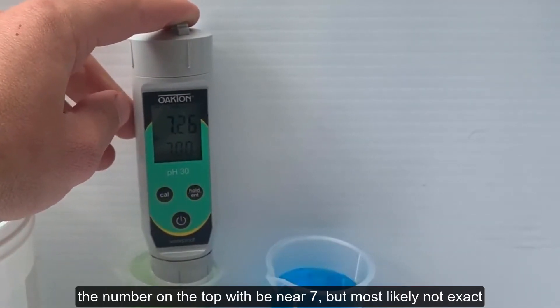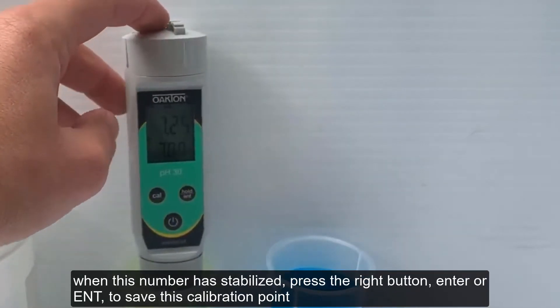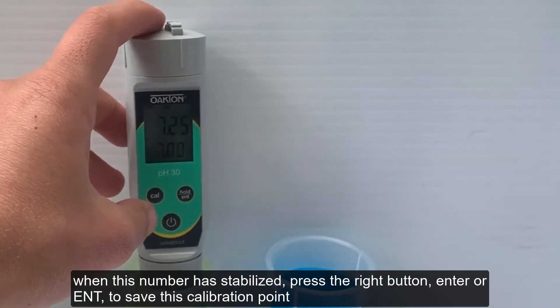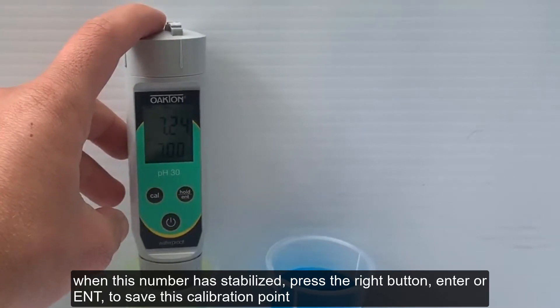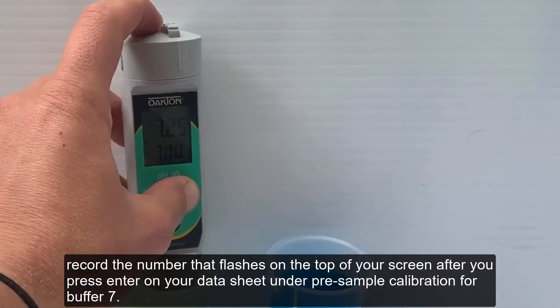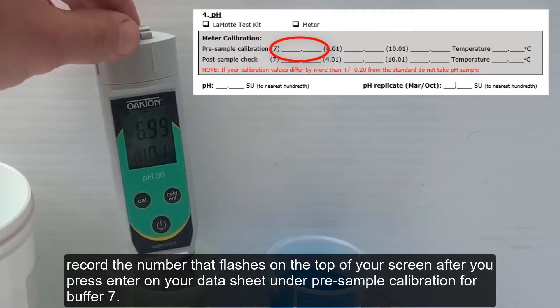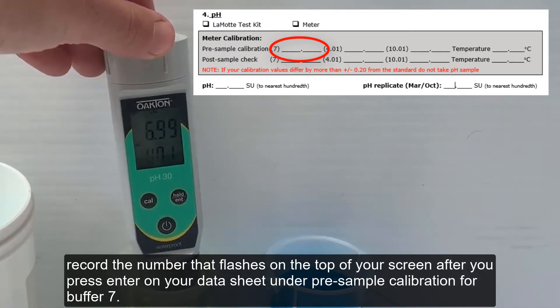The number on the top will be near 7 but most likely not exact. When this number has stabilized, press the right button, Enter or ENT, to save this calibration point. Record the number that flashes on the top of your screen after you press Enter on your datasheet under pre-sample calibration for buffer 7.